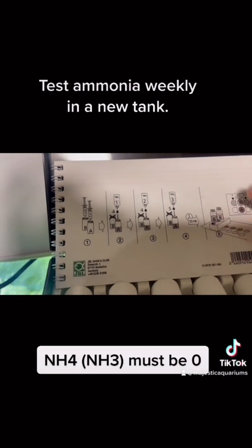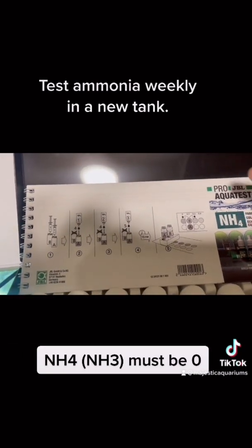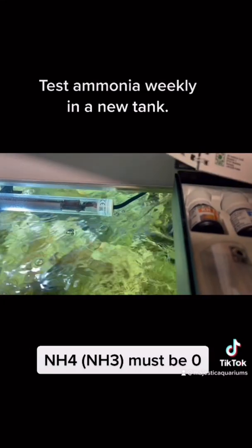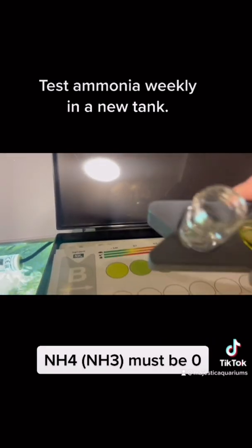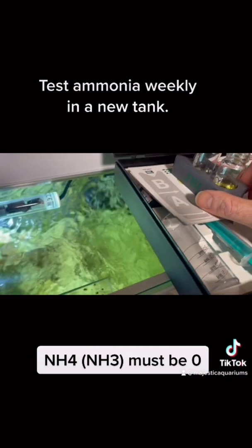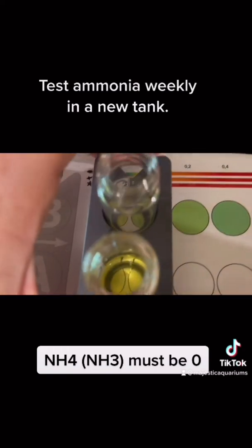Then what we're going to do is compare the color chart. So this sheet here tells you how to test the ammonia. Then you give it a flip over, like this, and we can see the colors. Then we get this little viewer and put that on the holes. So then when you look down it, you can see what the color is.